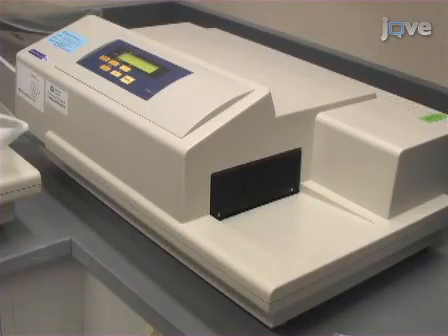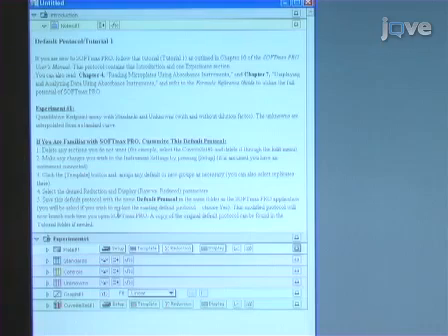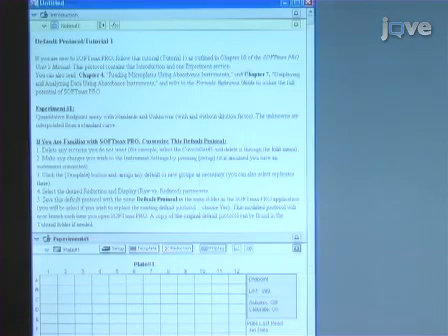The optimal polymer concentration will produce maximum enhancement of transduction as determined by FACS with minimal effect on metabolic activity as determined by MTT. For HDFs, 100 micrograms per milliliter of chondroitin sulfate polybrene is the optimal polymer concentration as determined by this method.